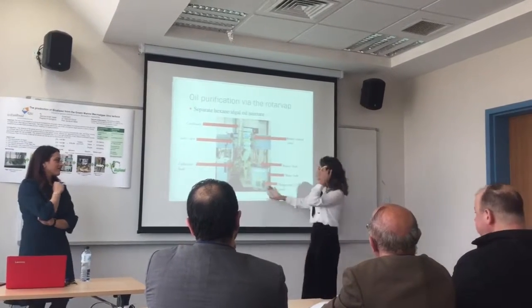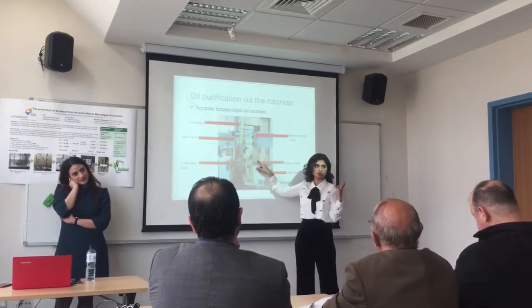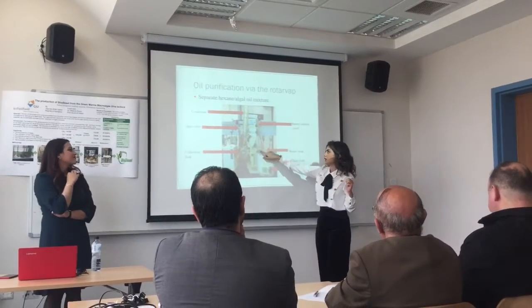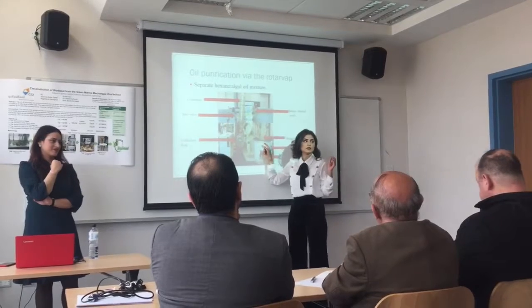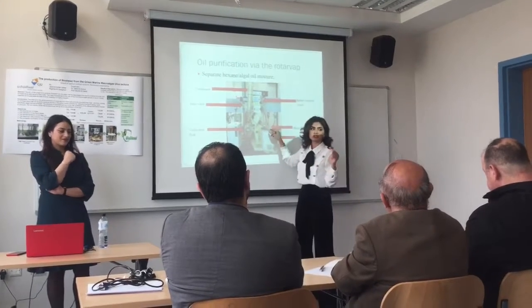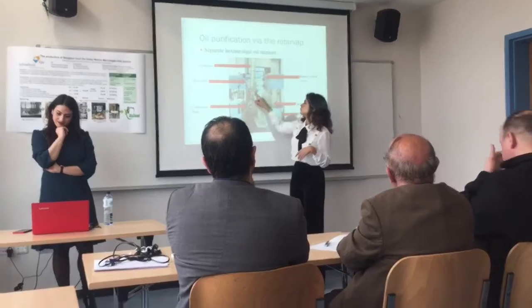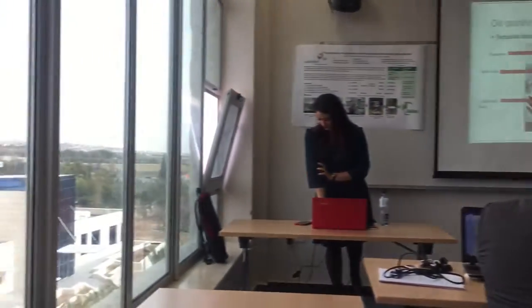As you can see here in the figure, here is the rotary flask that contains our mixture, the N-hexane with the algae. The water bath supplies heat to the mixture. The mixture is heated, less than the boiling point, until the N-hexane starts to evaporate. As the hexane evaporates, it will travel to the condenser. It again will condense and will be collected in our collection flask.